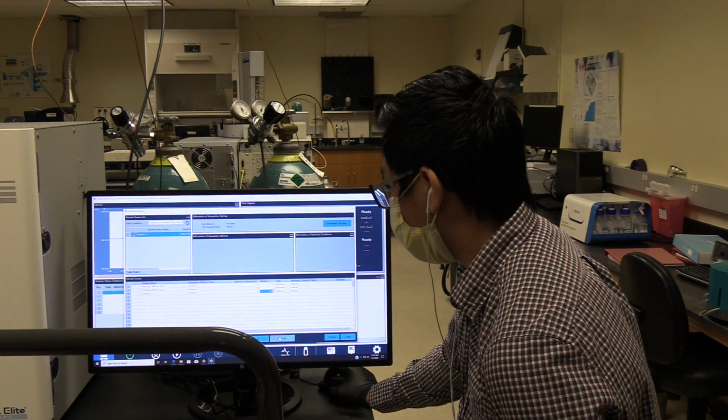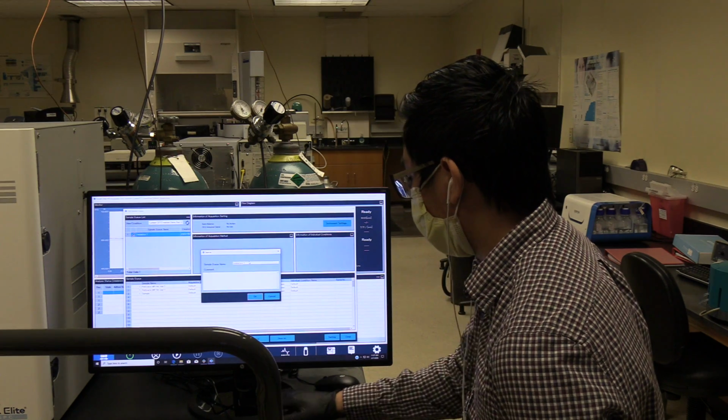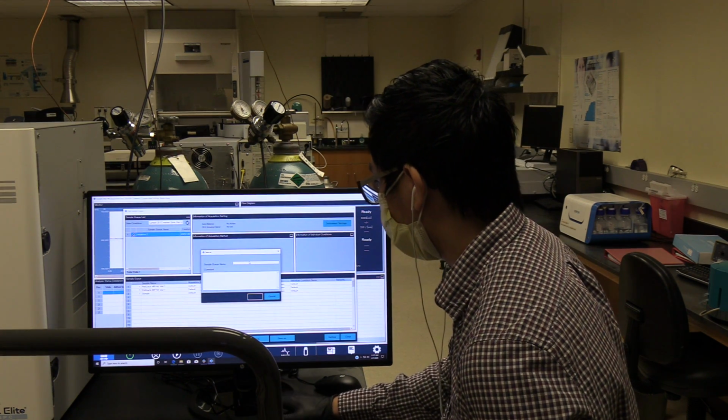Afterwards, I will click Save As, save my sequence name. So I would put sample, for instance.